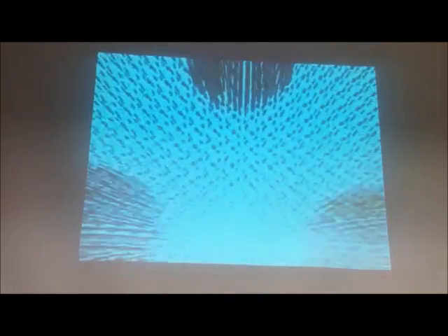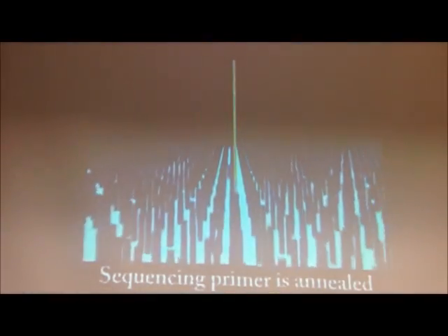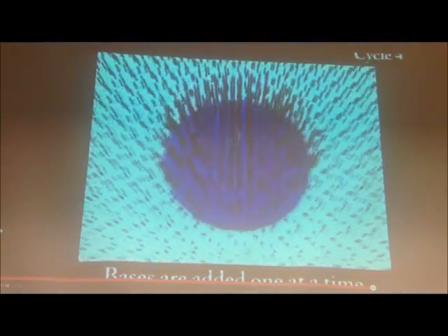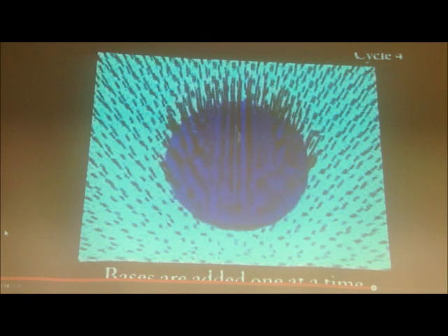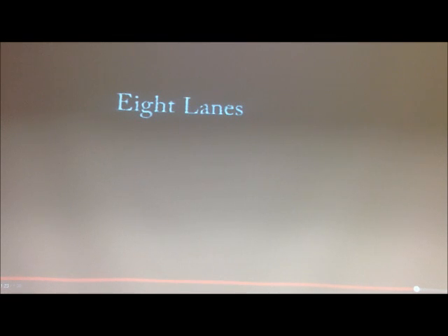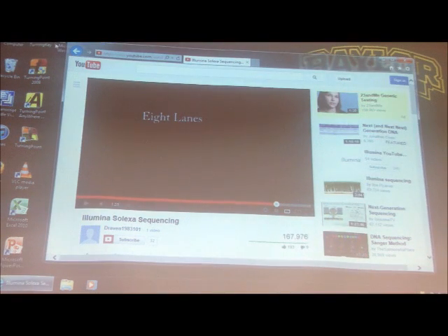We stopped at 106. Come on. There you go. It's just buffering this. Okay, now we take the sequencing primer, and we're going to build it one base at a time. The suspense is killing me. And every base, and I think actually I'm going to stop on here because there's better stuff for this.